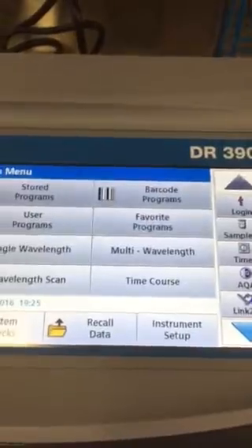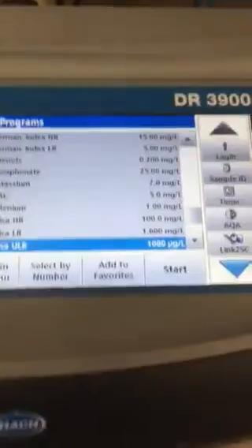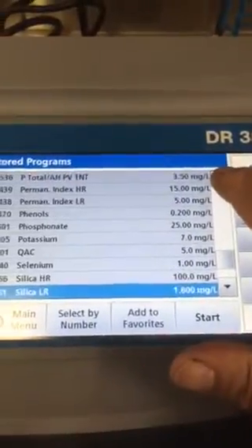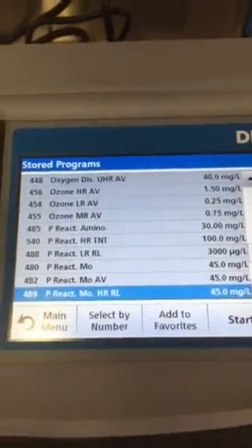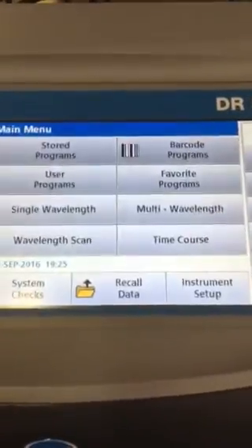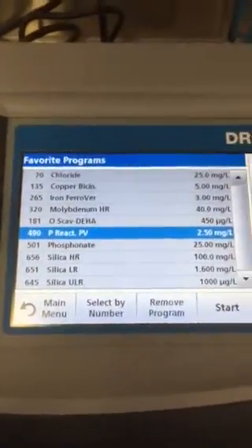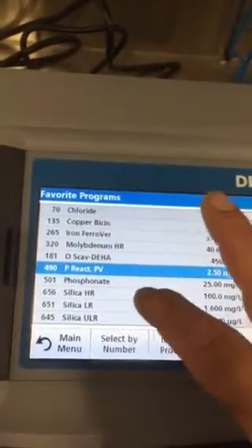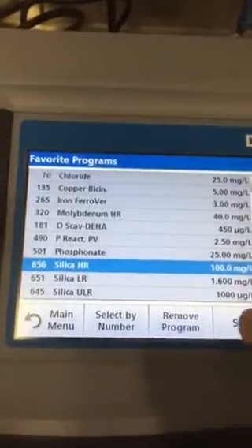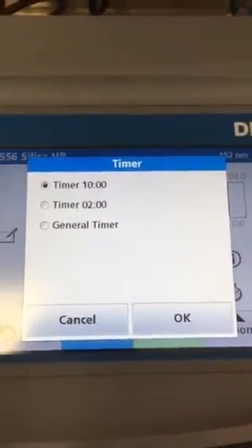Just like the DR 2800, if you go to stored programs it has all the programs that Hach provides. What I've already done is put all the tests we do at the plants every day into our favorites. So any test you need is already there — you just pick your test, hit start, there's a timer, and you hit okay.